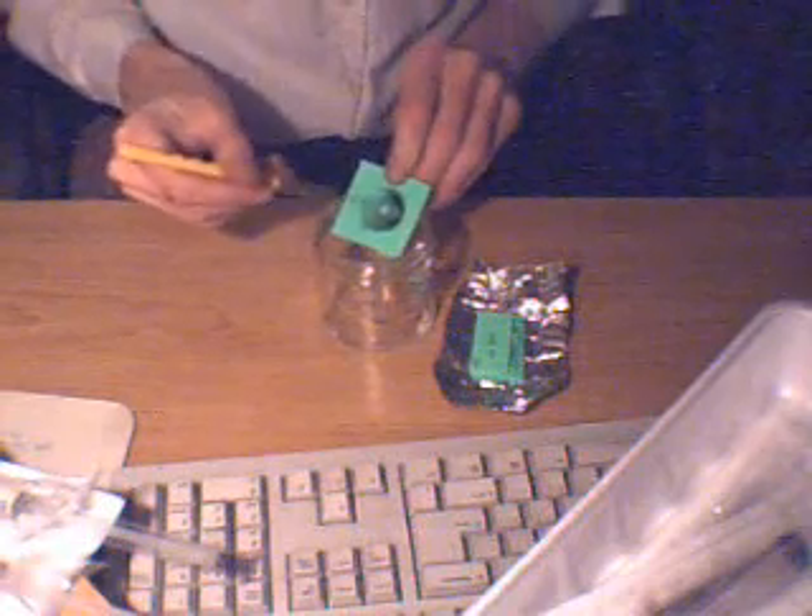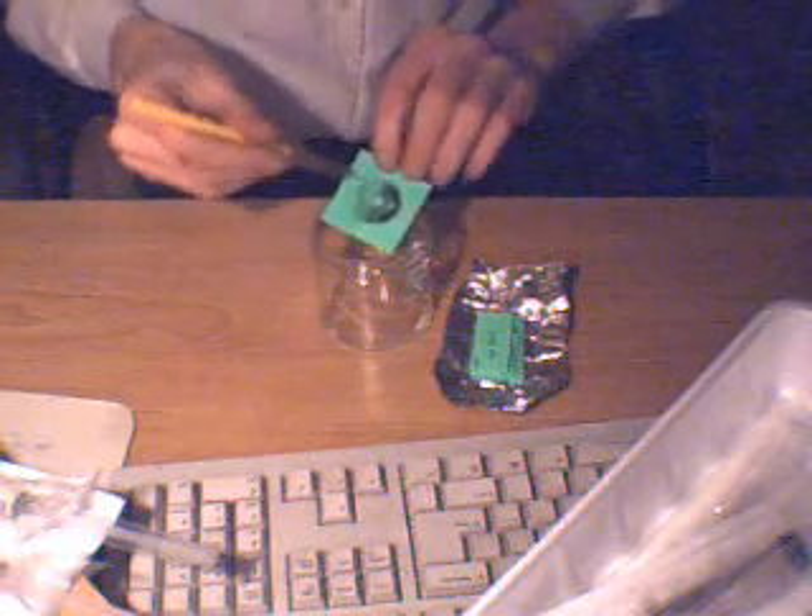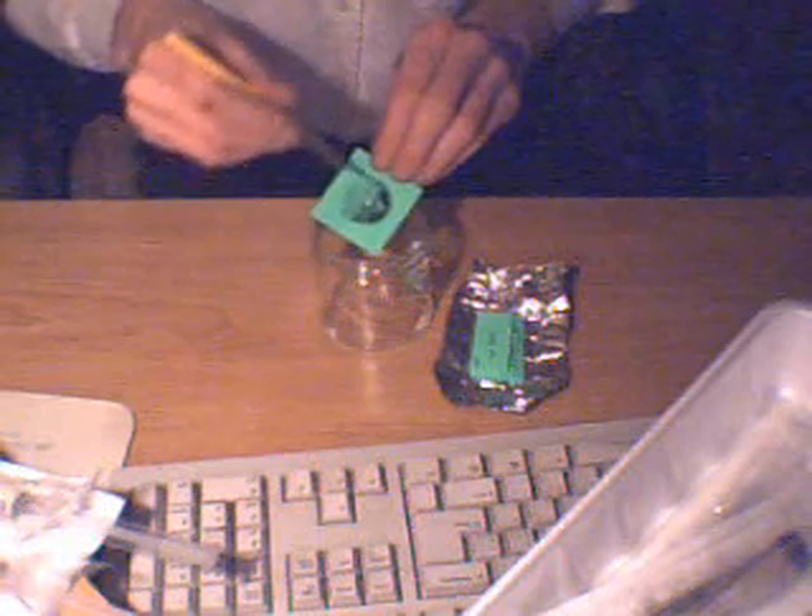Tap frequently to free any spores sticking to the paper or to the knife. Do not touch any of the sterile equipment with anything other than another sterile piece of equipment. As you can see, this will leave a moderate stain on the paper — consider this a loss and dispose of the remaining paper.